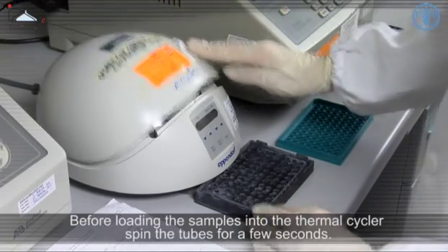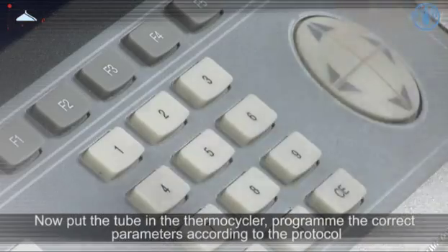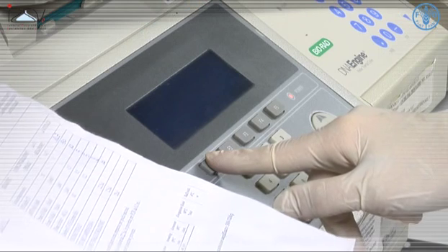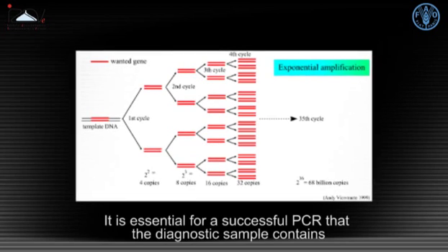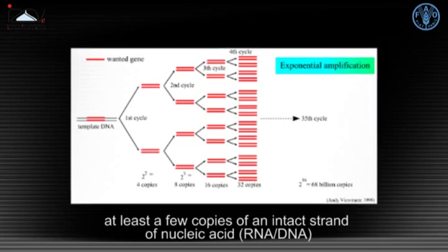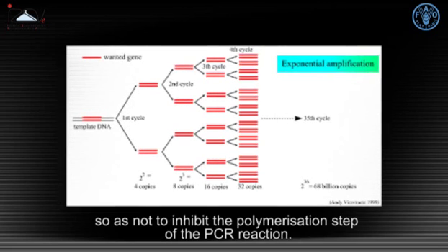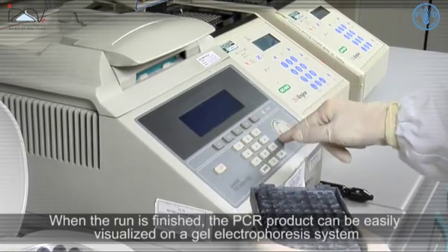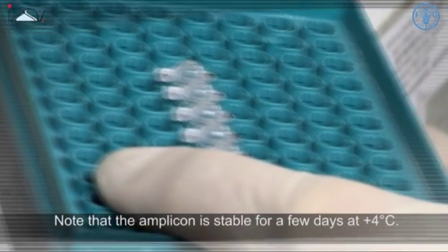Before loading the samples into the thermocycler, spin the tubes for a few seconds. Put the tubes in the thermocycler, program the correct parameters according to the protocol, and start the reaction. The polymerase chain reaction is an extremely sensitive means of amplifying a specific DNA sequence. It is essential for a successful PCR that the diagnostic sample contains at least a few copies of an intact strand of nucleic acid (RNA or DNA) encompassing the region to be amplified, and that impurities are sufficiently diluted so as not to inhibit the polymerization step. When the run is finished, the PCR product can be easily visualized on a gel electrophoresis system using a UV light source. Note that the amplicon is stable for a few days at 4 degrees Celsius.